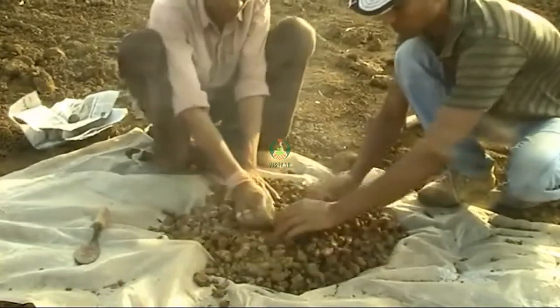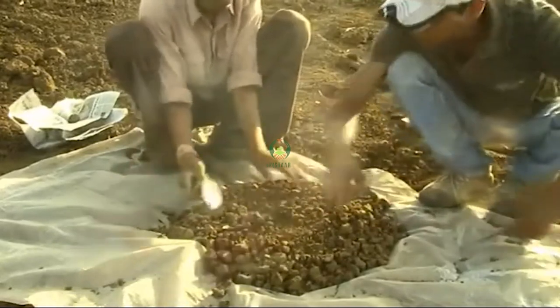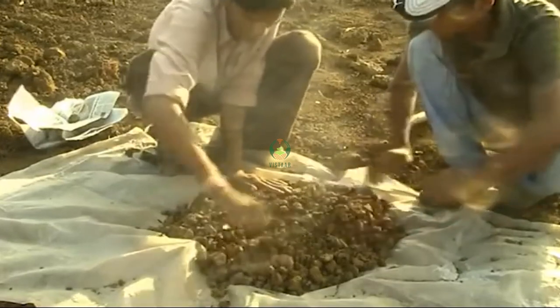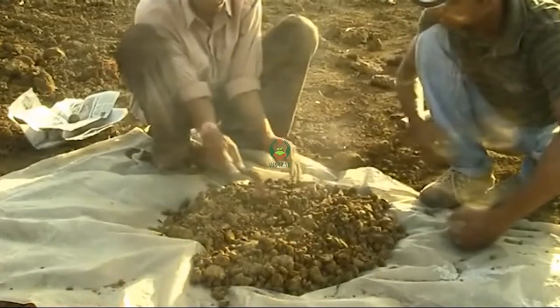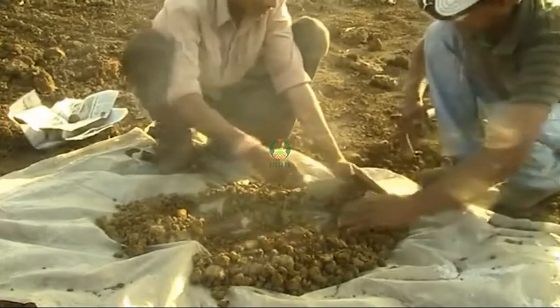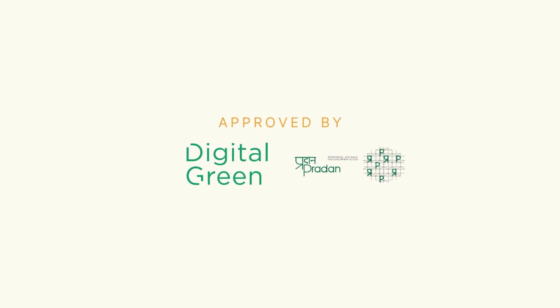Okay, let's get started. What do you do with the gun? I think we will cut it in 4 parts. How do we cut it? We will cut it in 4 parts — we will cut it in the first place, then we will cut it in the other parts. This is done. We will cut it in 2 parts. Which parts? This is done. Yes, it will cut it in 2 parts. And this is done. We will cut it out in 2 parts. Okay, thank you.